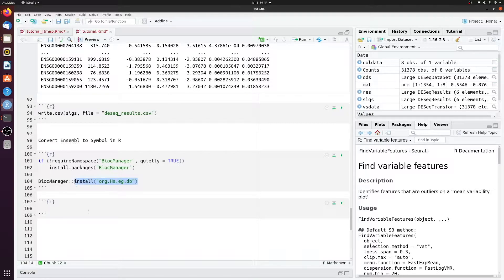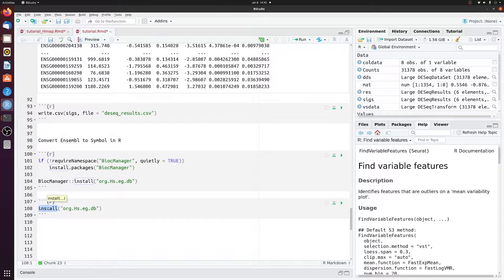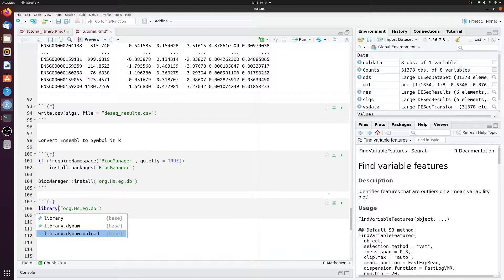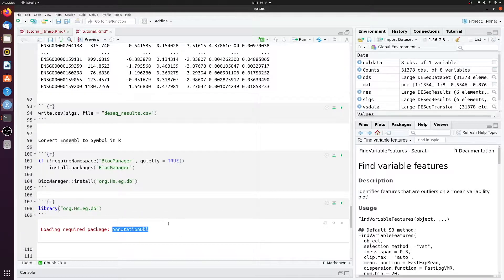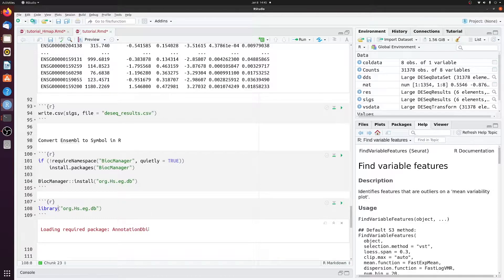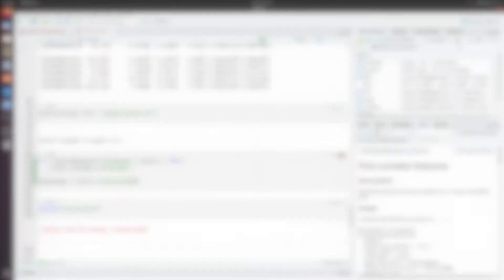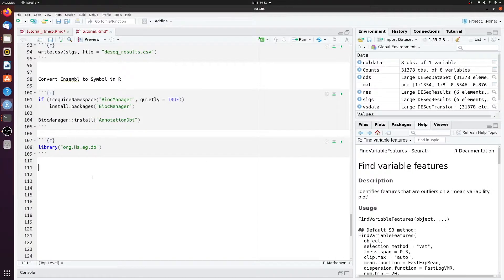So I already have it installed. Just go ahead and load that in. But it looks like I don't have this, so you would also download this from Bioconductor. Now we can load this.